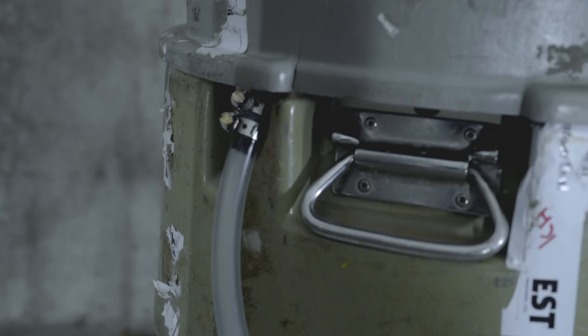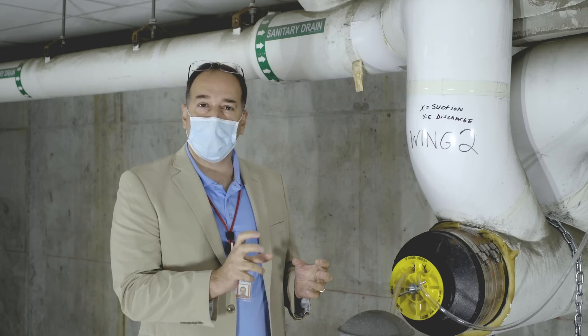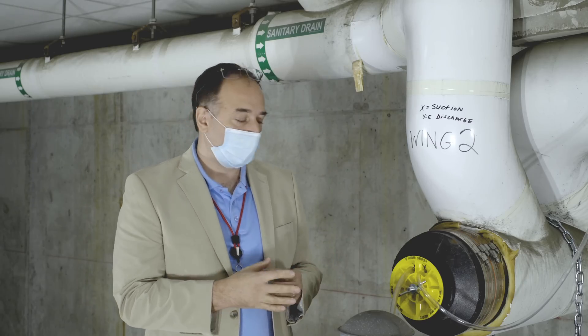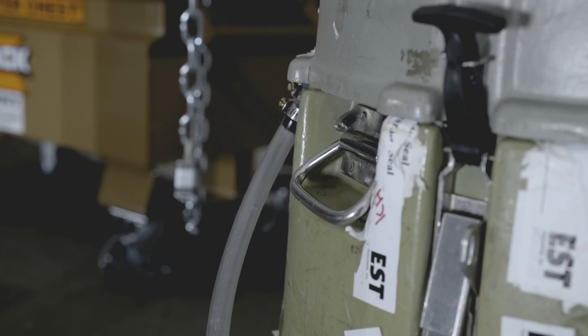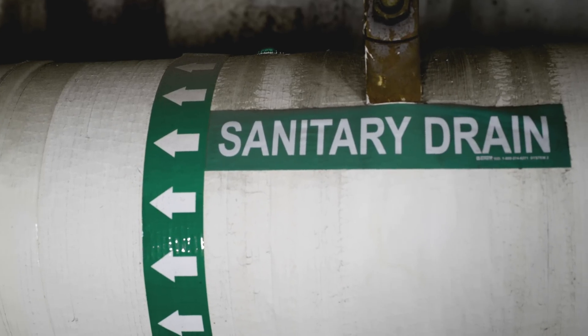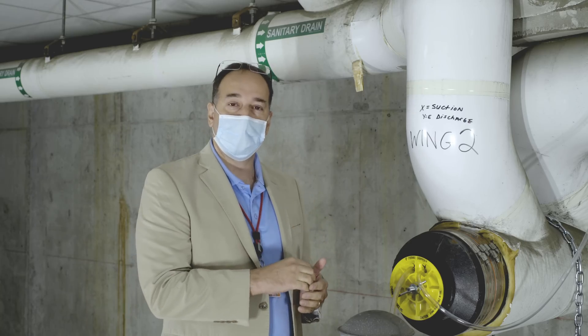The device that collects those samples contains a motor, a pump, a timer, and containers. The samples that we do not use get pumped back through the exact same line into the sanitary line.